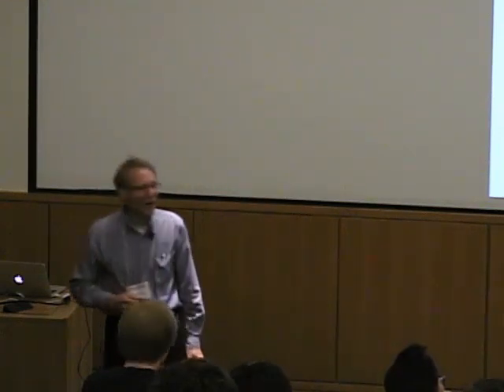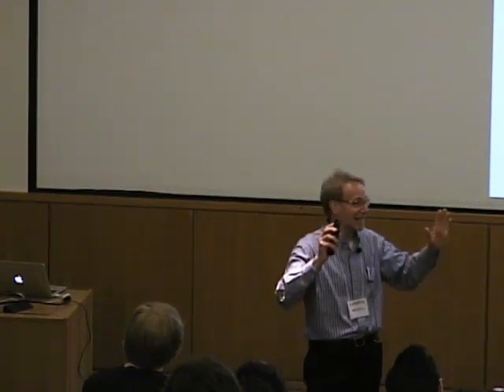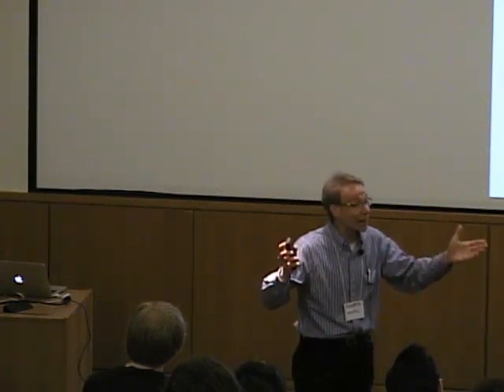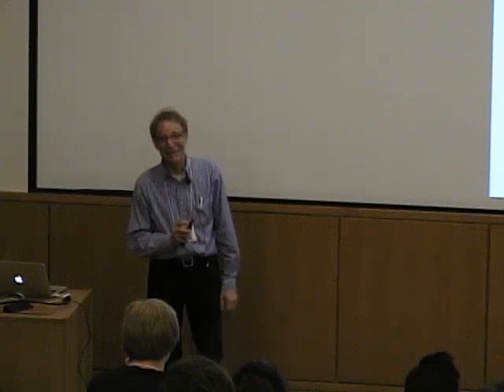Okay, are there any journal editors in the audience? No, there aren't any. Okay. I'm going to do something that's quasi-ethical, quasi-unethical here, okay? So I was asked to review a paper by a journal editor, okay? You know, it's sworn to secrecy. But this paper had some ITC data in it, and I thought it would be very instructive if all of us looked at it together and thought critically about what you can say about it and what, in fact, the authors may have overinterpreted. Now, all identifying information has been removed. This is anonymous, but I think it might be useful for all of us to do that. And we won't tell the editor, will we?